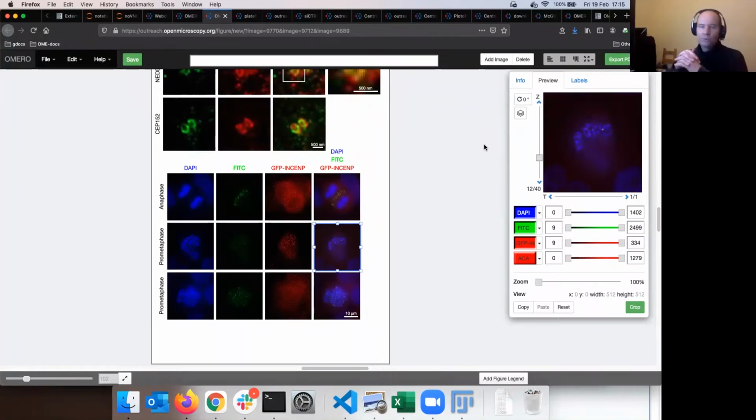And after a lot of work and exporting and reopening between those two software, you realize that you exported the wrong Z-plane. What does that mean? Well, you have to go and double back on yourself and start from scratch. Again, starting from ZEN, looking for the image, which one it was, then going to another Z-plane, exporting that Z-plane as JPEG, then putting that into Adobe Illustrator and so on, and you will lose time. I mean, buckets of that.